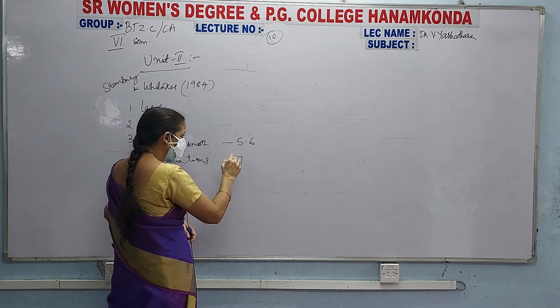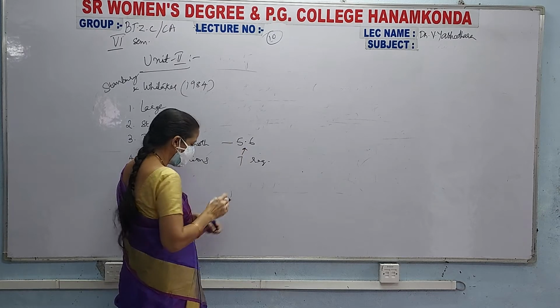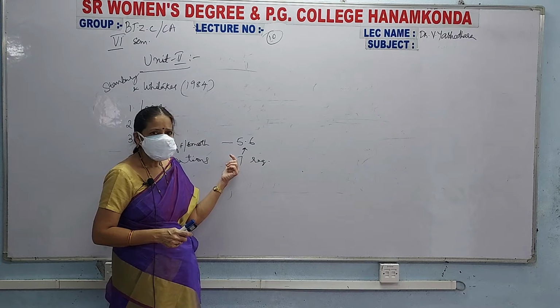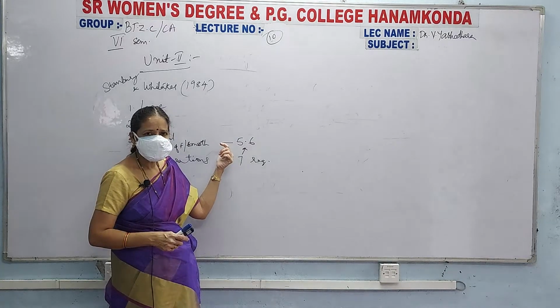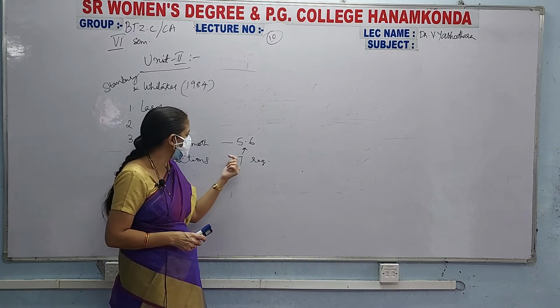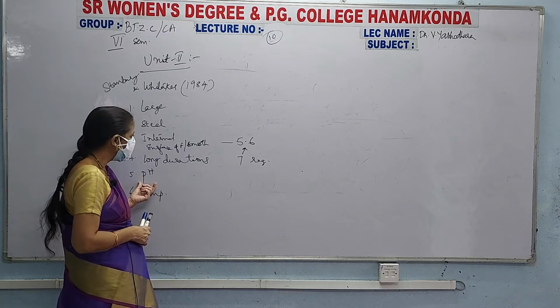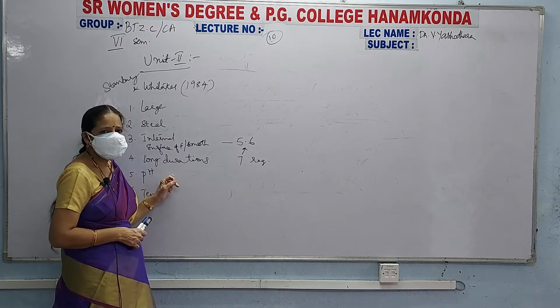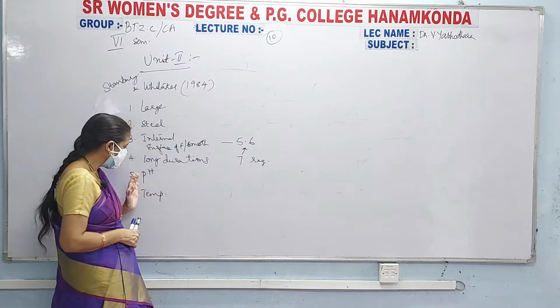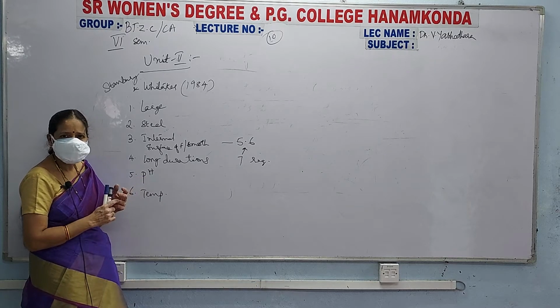It has to check the pH and regulate the pH. That means it should regulate the pH by addition of a base; immediately it will be converted into acid, that is 5.6. Okay, so see here, the pH of the medium should be checked and regulated. That means the equipment should be fixed to the bioreactor so that the pH of the medium should be checked and it should be regulated.